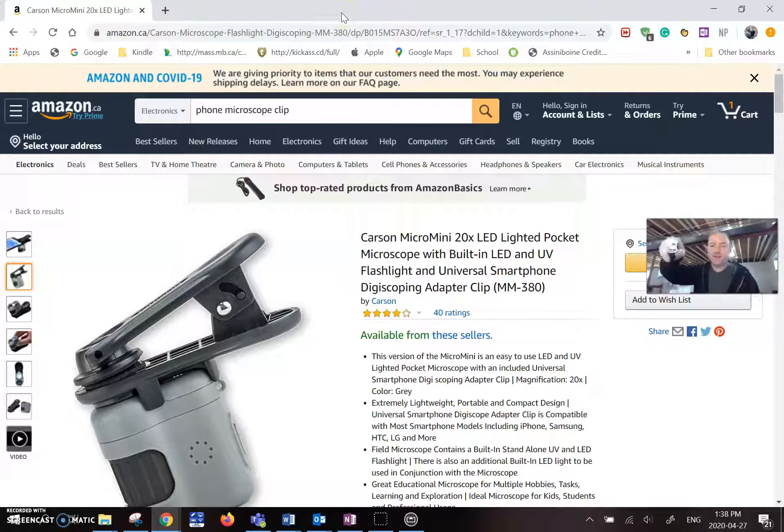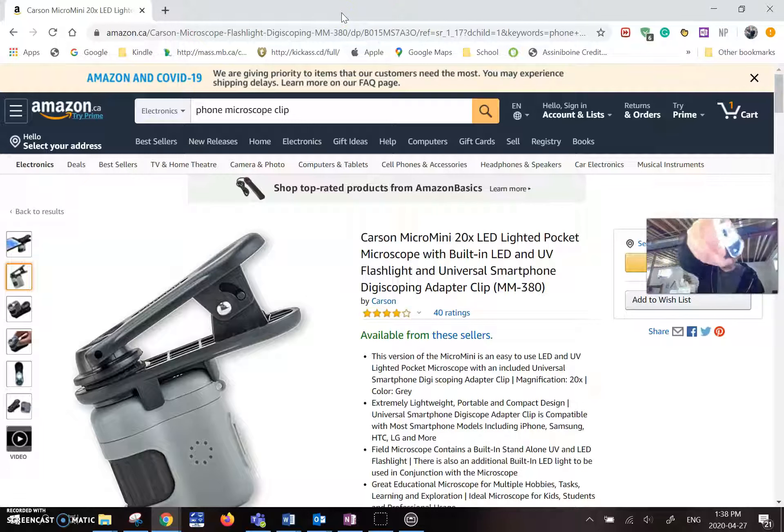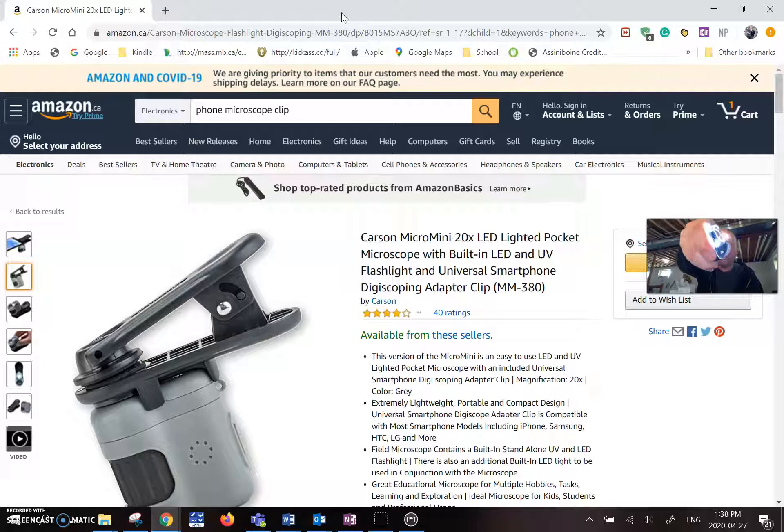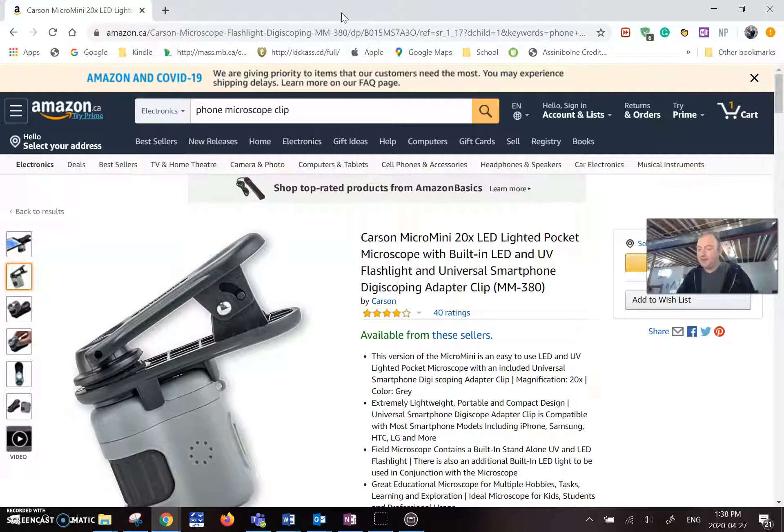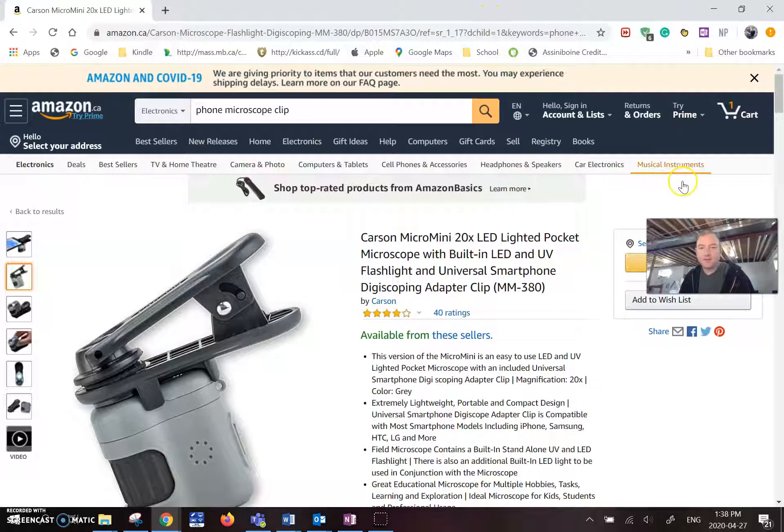Also comes with a light as well. So you can see that the light. You can either shine a blue light or a white light or off. So I'll just show you that takes triple A batteries or mine does anyway.